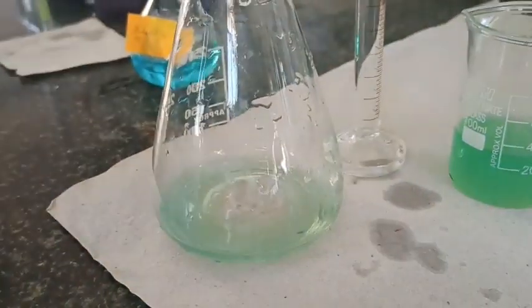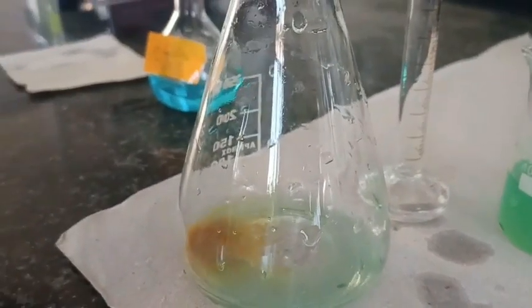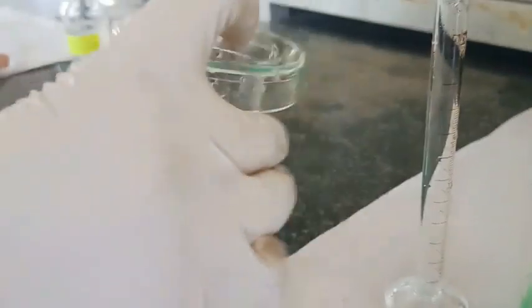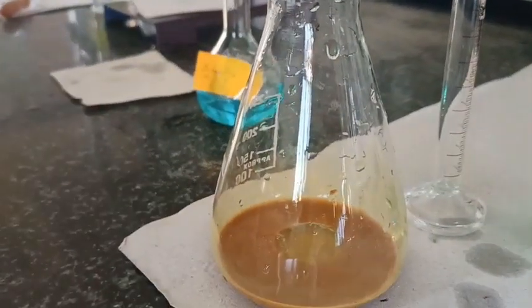So I am going to add 1 gram of potassium iodide to this. You can see the color. I will leave it after covering it with the help of a petri dish for 2-3 minutes. And now I am going to titrate it again. The initial reading is now, you can see, 14 ml.